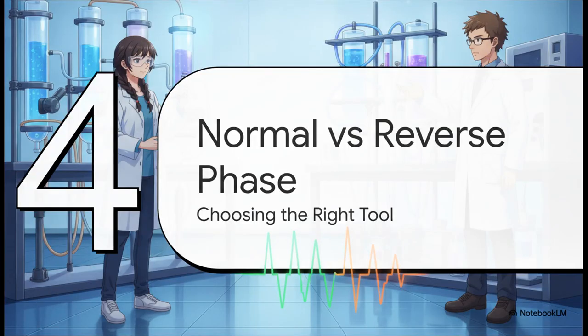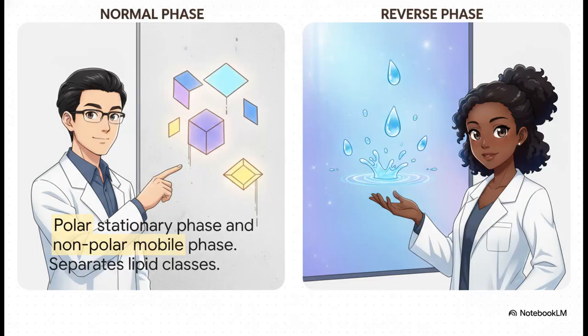Moving to section 4, normal versus reverse phase. This is all about choosing the right tool for the job. If you spend any time around modern laboratories, you already know there's another massive player in town, reverse phase chromatography. It's exactly what it sounds like, a total inversion of the system we just talked about.